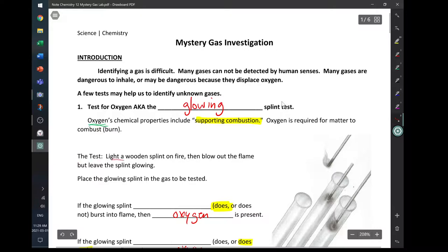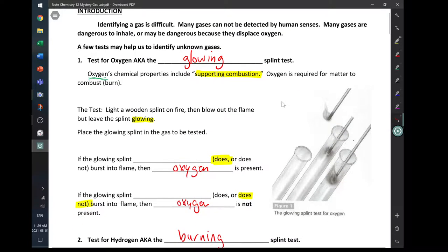So our test is we're going to light a wooden splint on fire. We blow out the flame but we leave the splint glowing. That's why we call it the glowing splint test. It looks like a little orange ember. And then we place the glowing splint, the little ember, in the gas that's to be tested. If the glowing splint does burst into flame then oxygen is present. And if the glowing splint does not burst into flame then oxygen is not present.